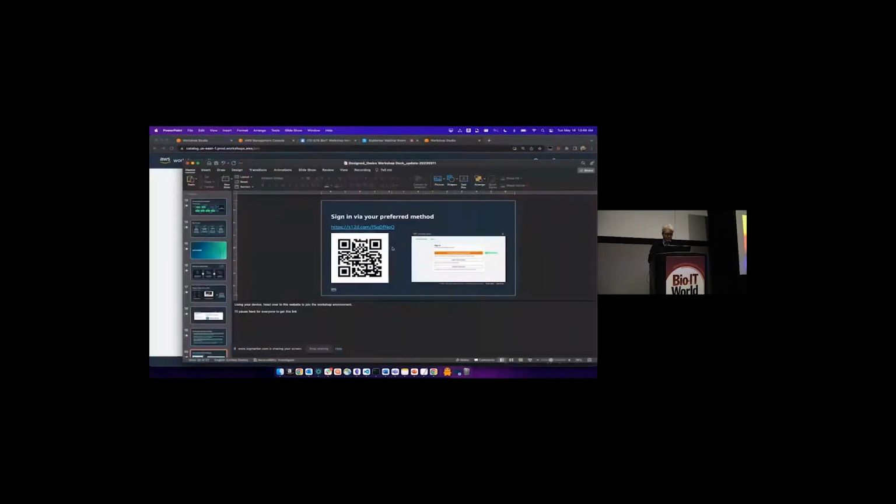Okay, so this is, we'll get to here. Sorry. Sure, I'll pop back in here. I wish there was a way to just keep this. There's no whiteboard. We would write it down. Yeah.